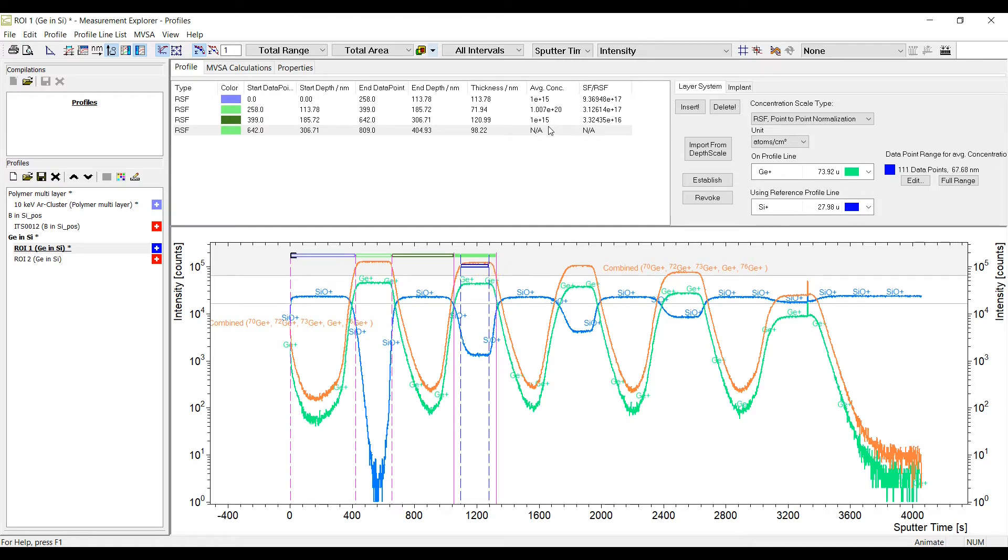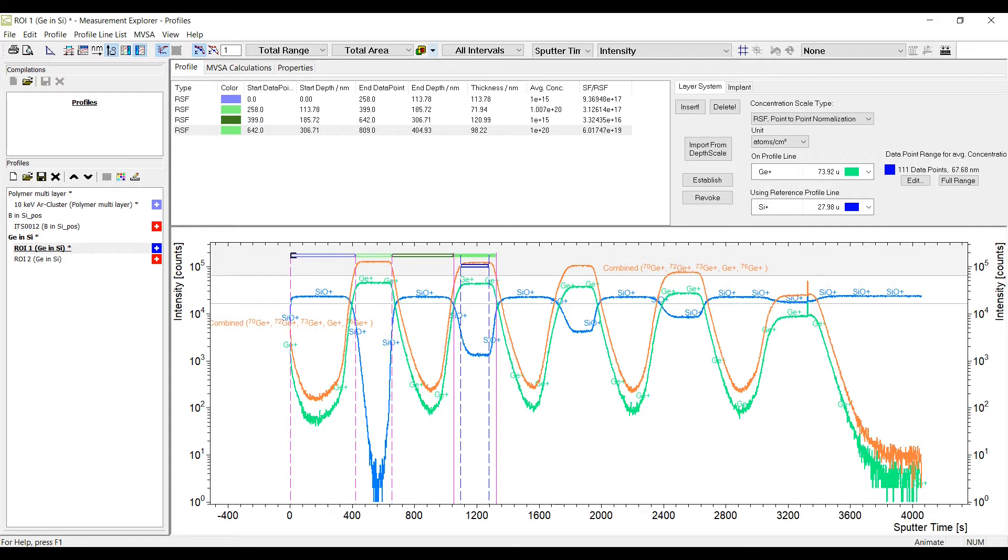Within each section a data point range can be specified to be used to determine the RSF. The concentration scale can be established by entering either an average concentration or the RSF into the column of the layer list.